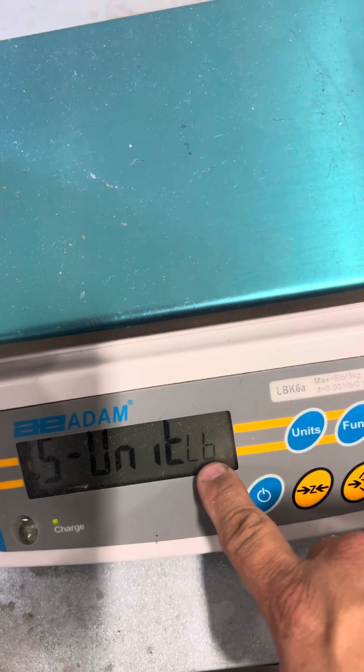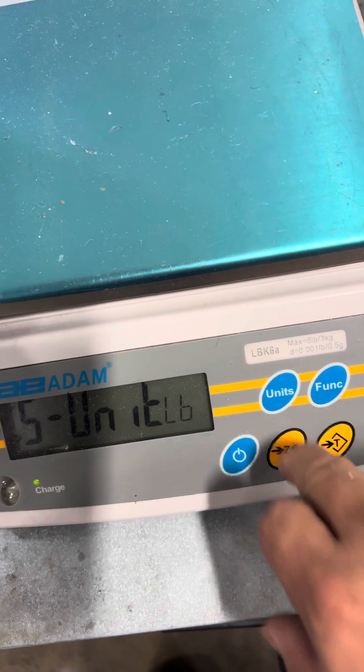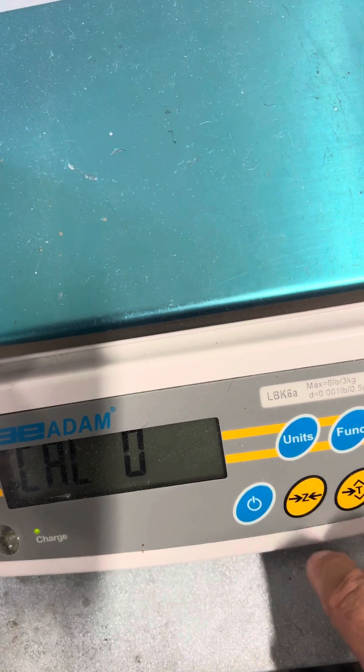If you want to adjust it in pounds, you leave it. If you want to change it, you hit the units key. Press zero, then dash a zero. Obviously with no weight on the platter, you press zero.